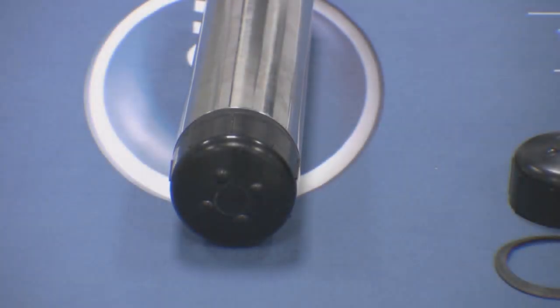The LDO cap is an integral part of the operation of the LDO probe. It houses the Lumafor material which enables the probe to measure dissolved oxygen. If this Lumafor is damaged or the cap reaches the end of its two-year life, it needs changing.